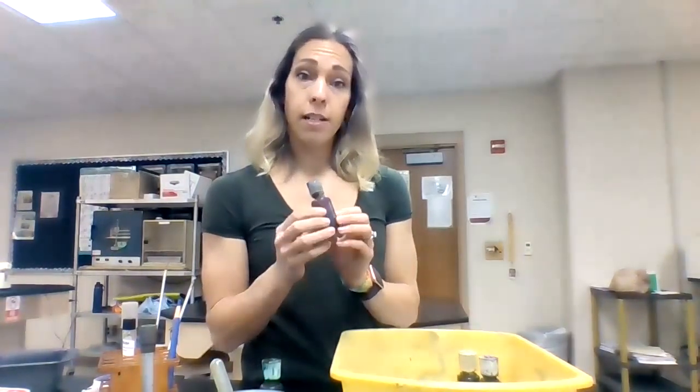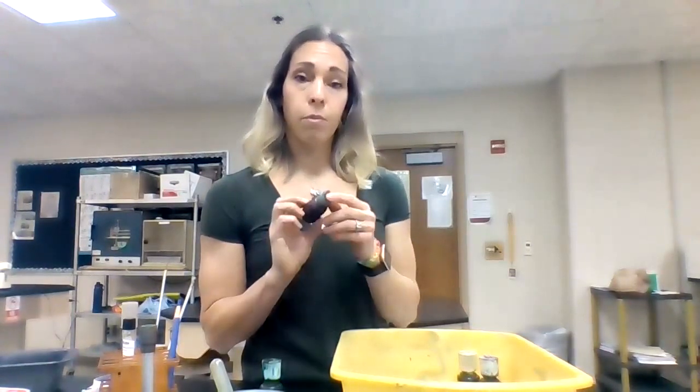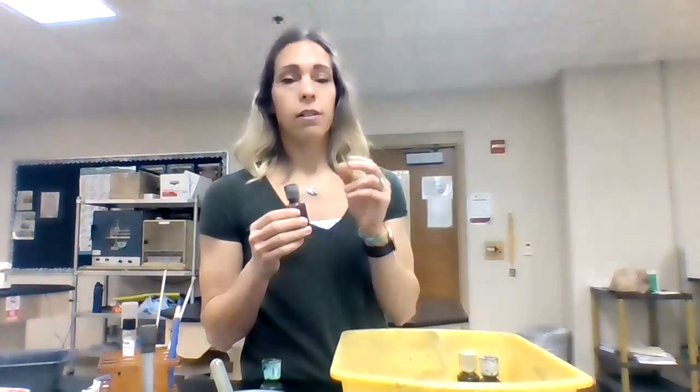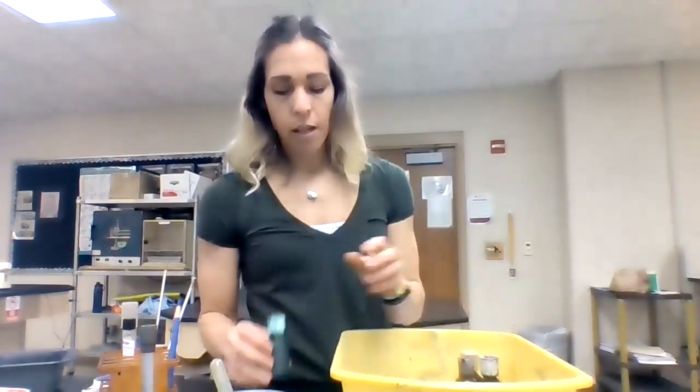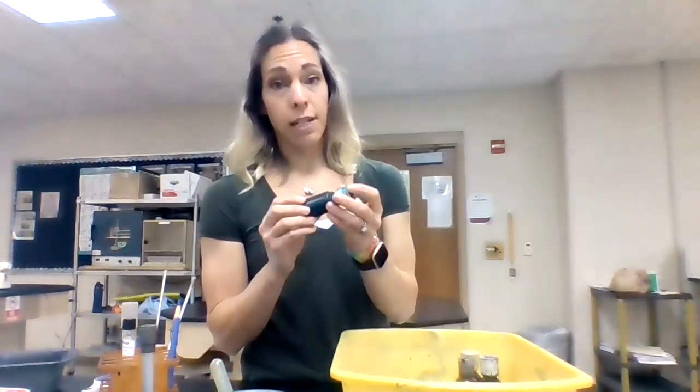The other one you have is safranin — safranin is a pink colored stain, labeled with an S. I remember this one because saffron the spice is kind of like a pinky colored thread, so safranin is a pink colored stain. And then you have malachite green — just like the name, it's green.